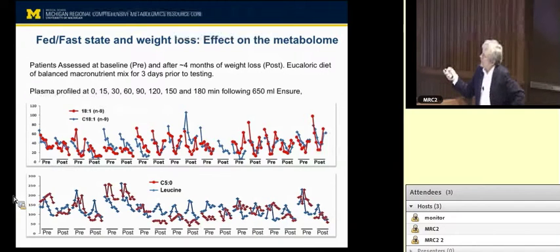So here's the plasma level of the 18-1 fatty acids. This is the total amount of 18-1 fatty acid when we measure the total amount in the plasma. This is taking triglycerides, the phospholipids, the cholesterol esters, and we hydrolyzed all the fatty acids off of all these lipids and just measured the total amount in the plasma. Arun did this for us.